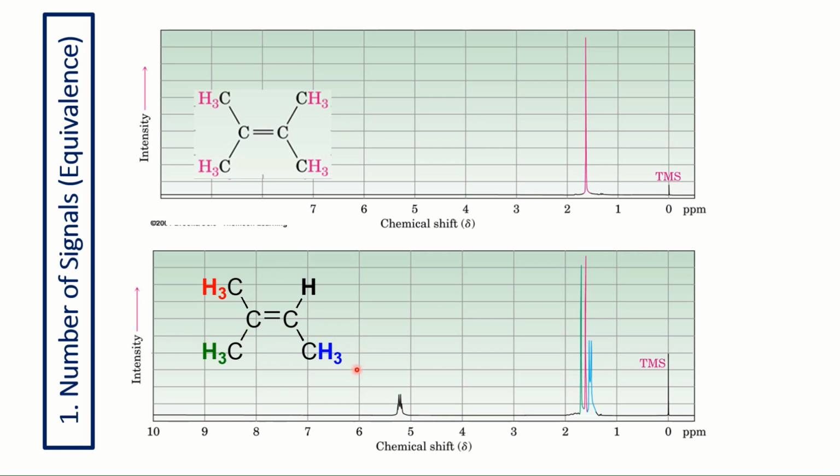And we cannot rotate around this bond, and so these protons are going to appear as 4 different signals. So herein we got this fella here, it's a quartet, and then of course we have some singlets here, and this appears as a doublet. This one appears as a doublet here.